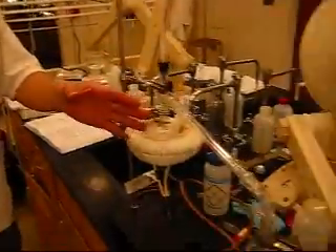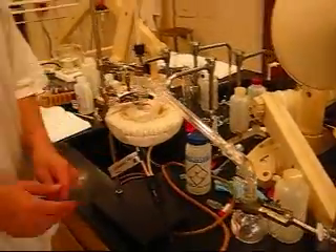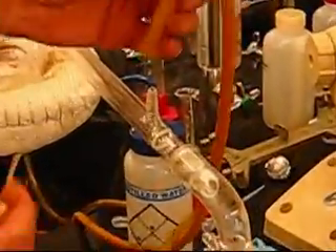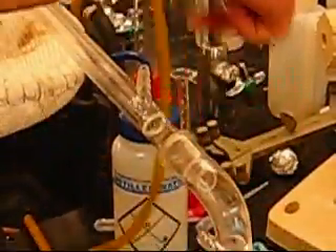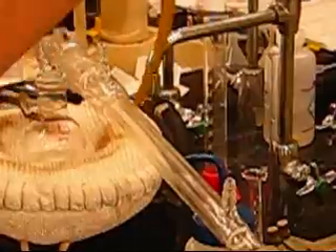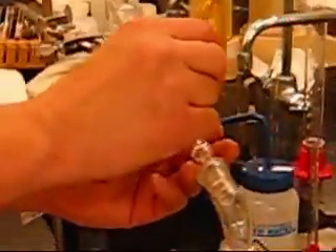The final part in assembling this apparatus is finishing the actual condenser. This is the condenser — it works by providing cold to whatever the steam is traveling through. To connect this thing, we always remember that in organic chemistry, water flows uphill, meaning we want the water to come in here and come out here.